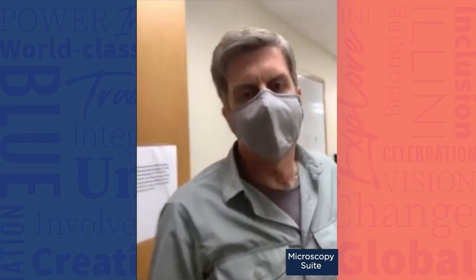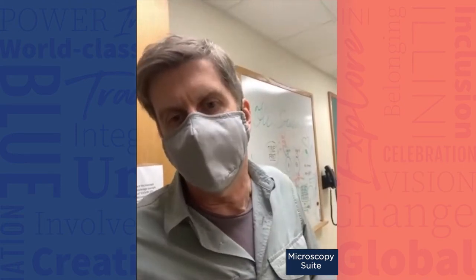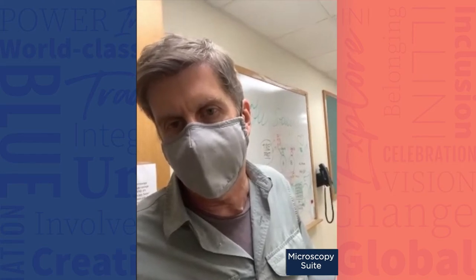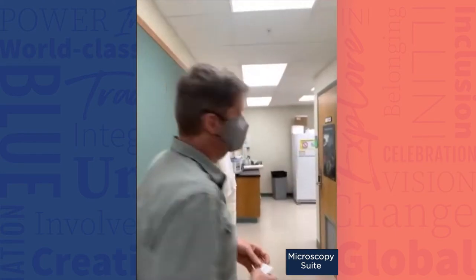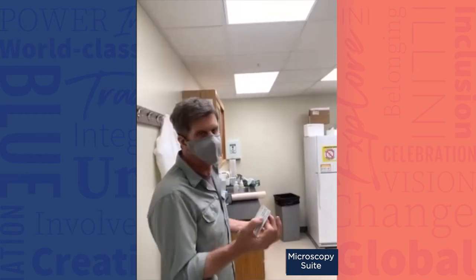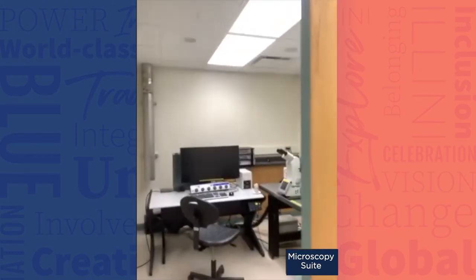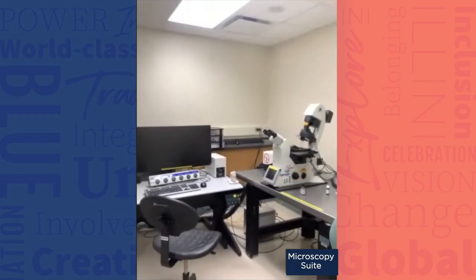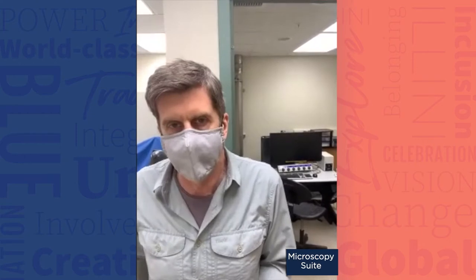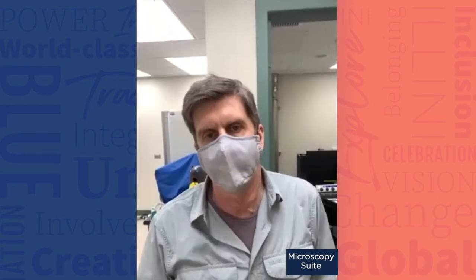The space we're entering now used to be a clean room — we completely reconfigured it. We can work with live cells in here; this is biosafety level two compatible space. We're also set up to do cell culture if we need to. Mostly it's people keeping their cells alive so they can use this instrumentation. A couple of incubators in here, biosafety hood, refrigerator. And this is the SP8 — it has an Oko Labs incubator on it, so you hook that up to CO2 and you have a very small incubator about the size of a cigarette pack, and you can keep your cells alive.